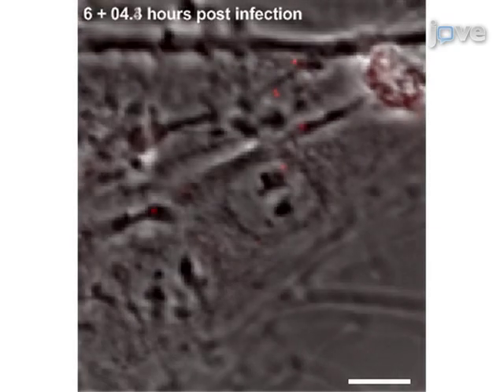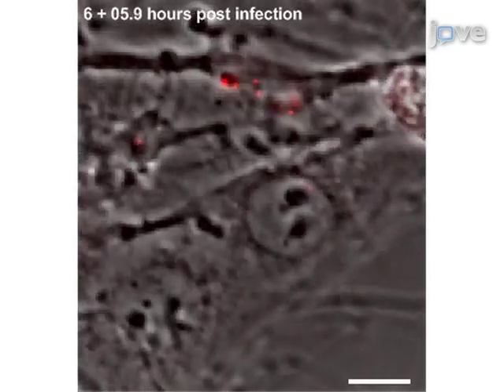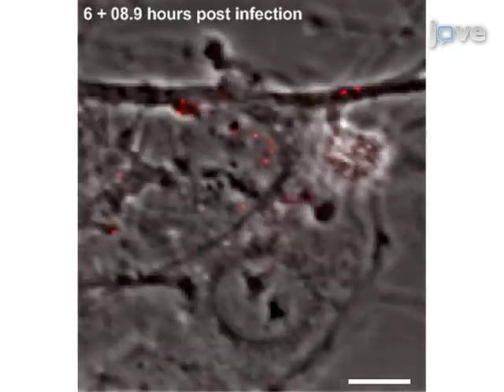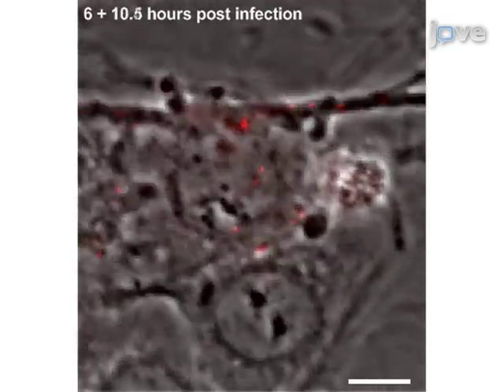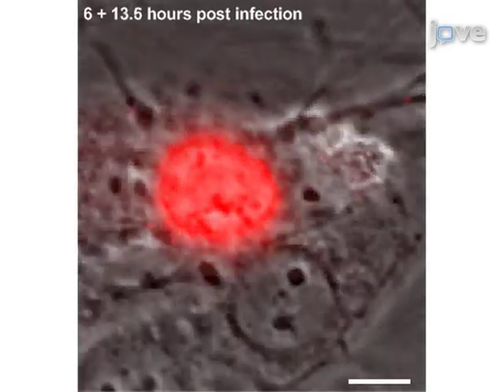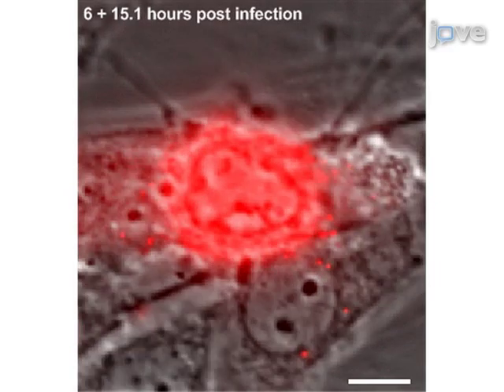Infected cells can be tracked backwards to visualize the fluorescent capsids that initiated the viral infection. These individual cells can be isolated from the large frame and tracked without a significant loss of detail. While attempting this procedure, it's important to remember that live cell microscopy impacts a biological process being observed. However, careful optimization of these protocols allows visualization without alteration.